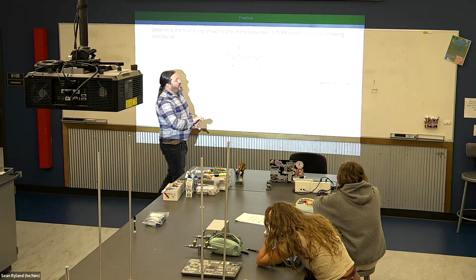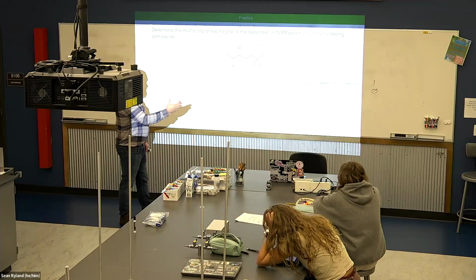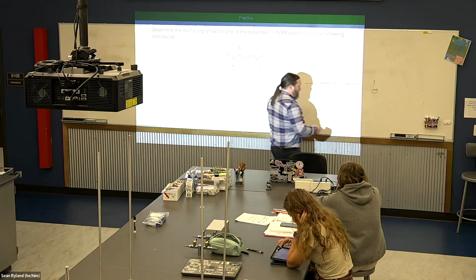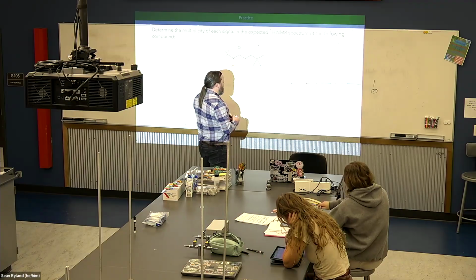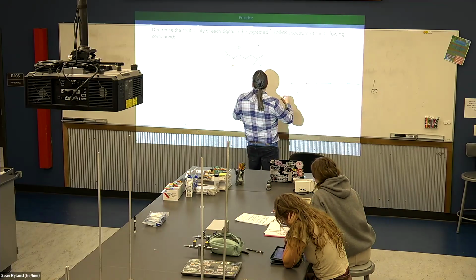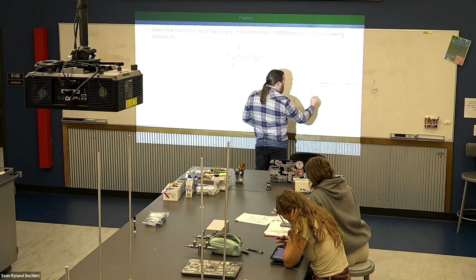So that's two of the four pieces of information that we can get from an NMR, right? Number one is how many signals. Number two is what order from right to left. Then there was the integral. For each of these, we can figure out the integral too, because if this one has an integral of 1, these ones should both be twice that size.